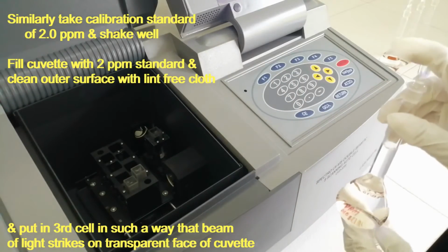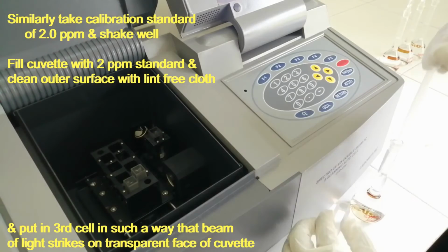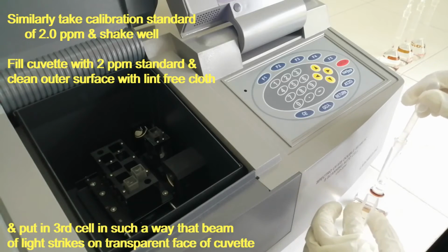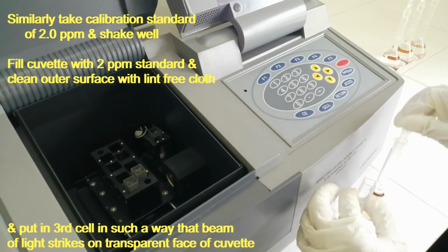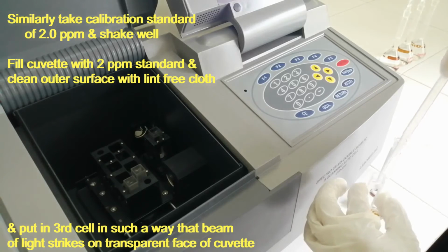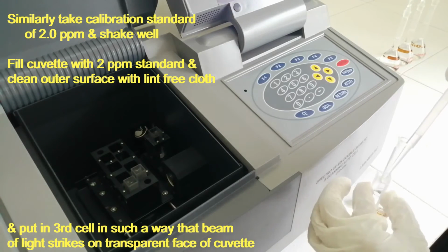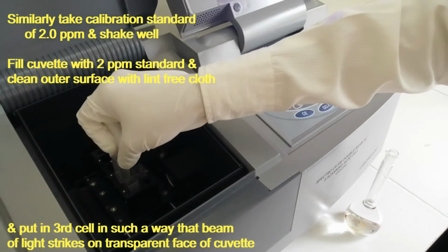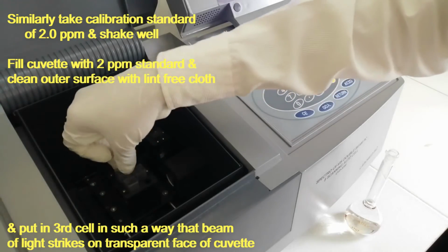Similarly, take calibration standard of 2.0 ppm and shake well. Fill cuvette with 2 ppm standard and clean the outer surface with lint-free cloth. And put in third cell in such a way that the beam of light strikes on the transparent face of the cuvette.